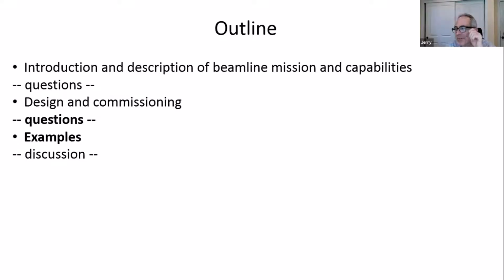All right, so two questions. First one, TEY mode. Right, so we are working on that. That's definitely something that a number of users are interested in. What we're working on is building that into a sample holder so that it's close enough to the sample, so that we mount a number of samples inside that detector itself and mount that to the sample stage. That's one thing we're working on, because we do recognize that. All right, and then the XAS question or comment?